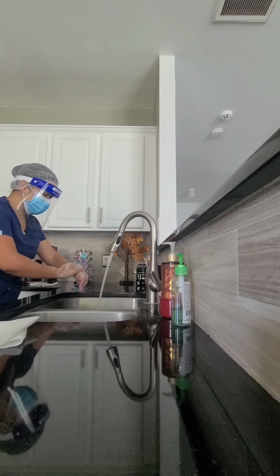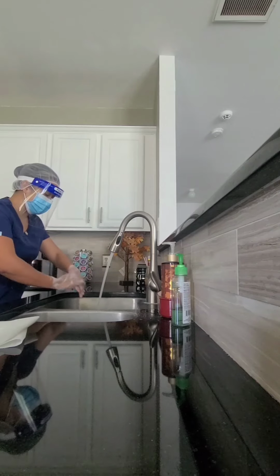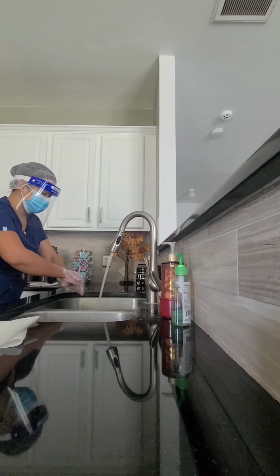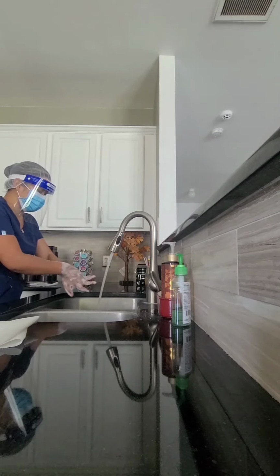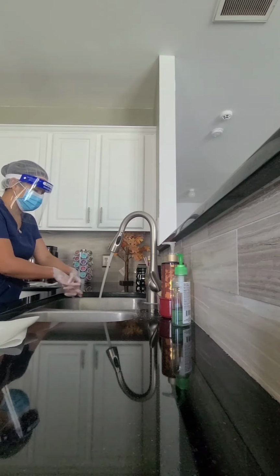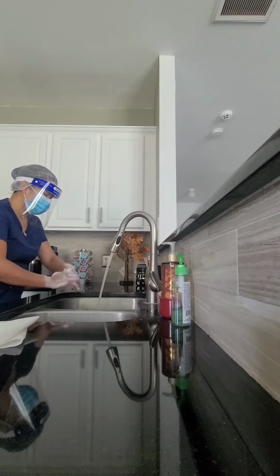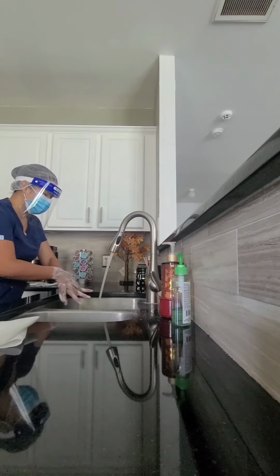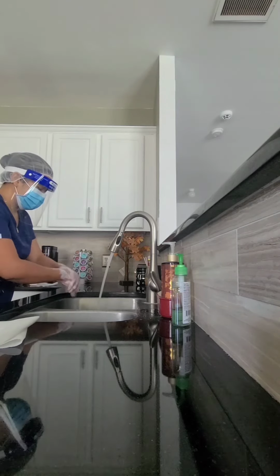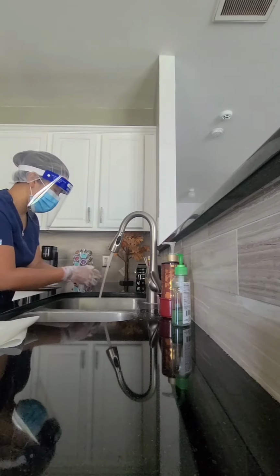Alright, and I want to make sure I have my clothes not to touch the sink and my fingertips downward like this. And I'm going to clean between my fingers as well. And now I'm going to use the nail brush for about 20 seconds.